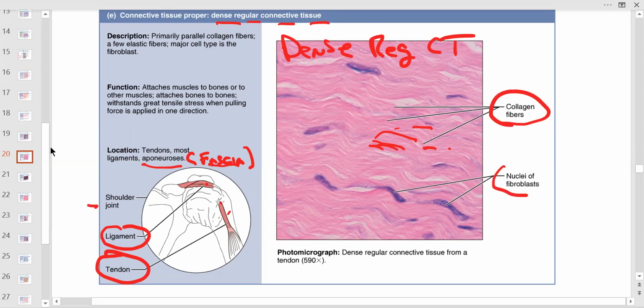And here's a fibroblast, which is laying down the collagen. So the machinery in a fibroblast is about building those amino acids for collagen. Collagen. I bet you I say that 60 times before we're done here. Collagen. Start counting. Appleton, start counting.